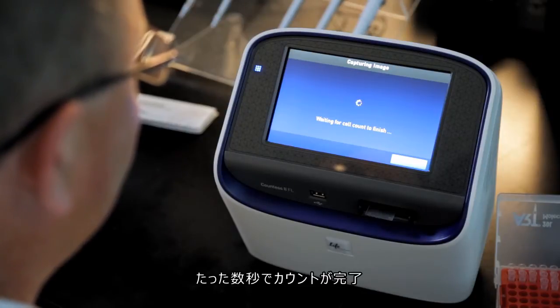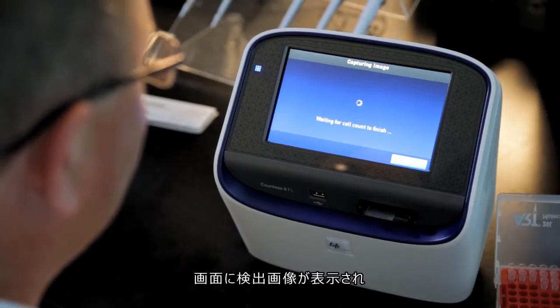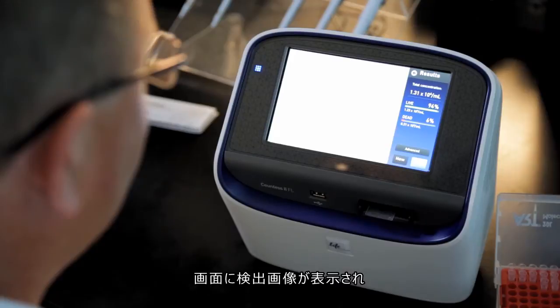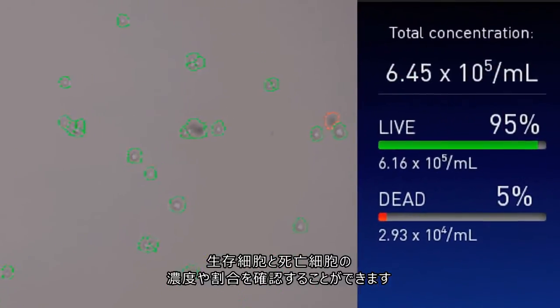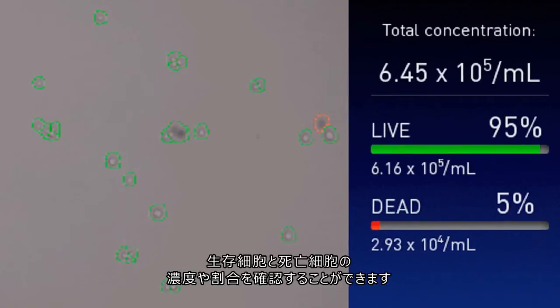Cell counts are collected in under 10 seconds. The Countess2 FL cell counter provides an image of the results for visualization, showing the concentration and percentages of both live and dead cells within the population.